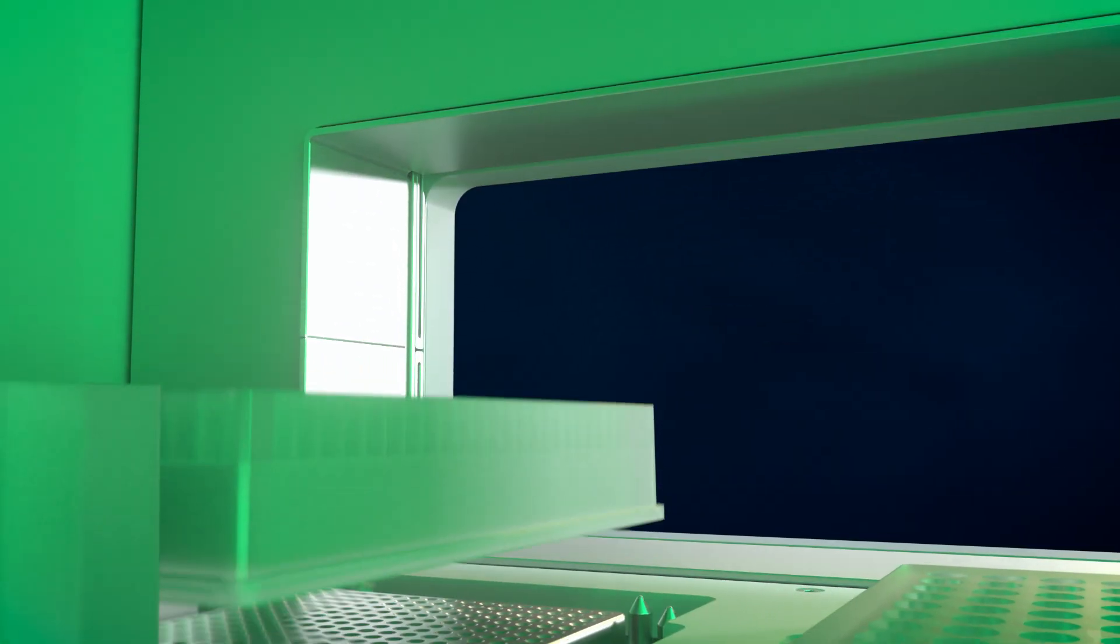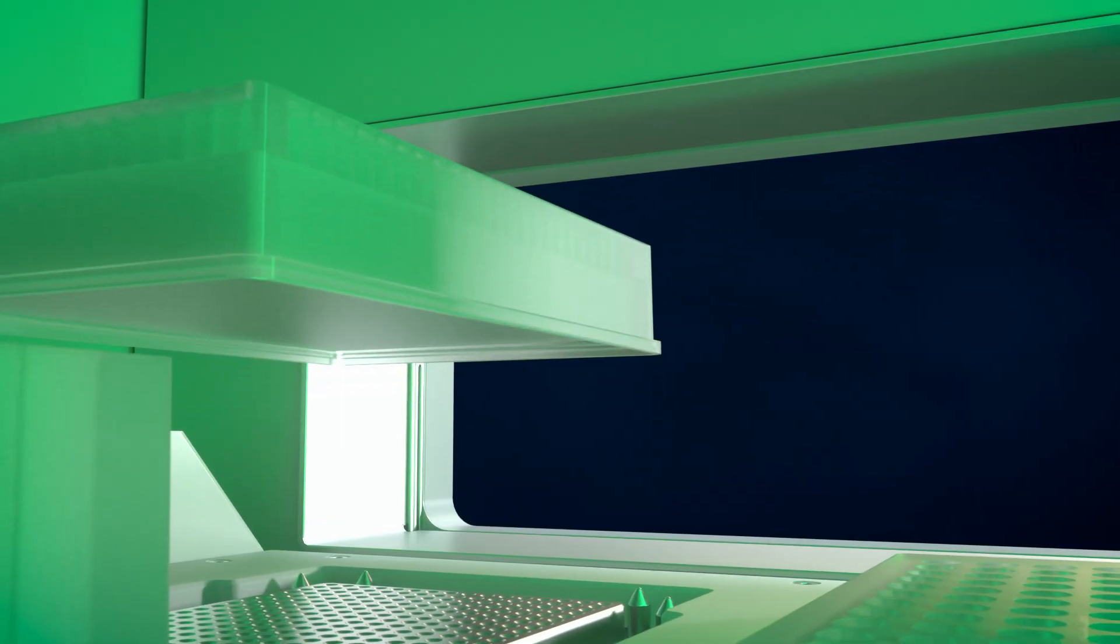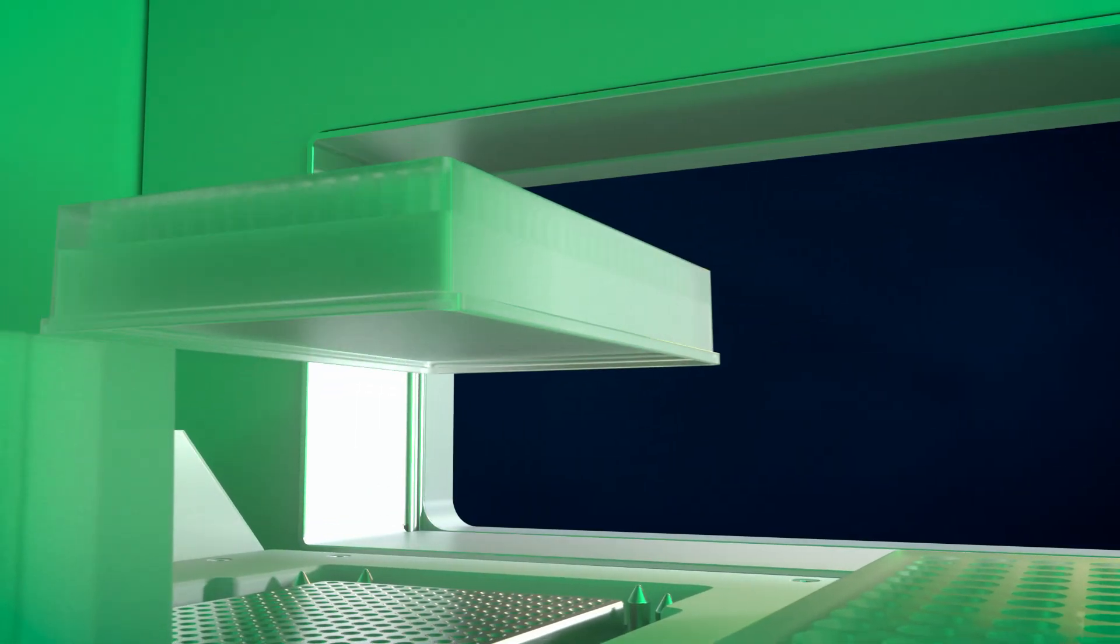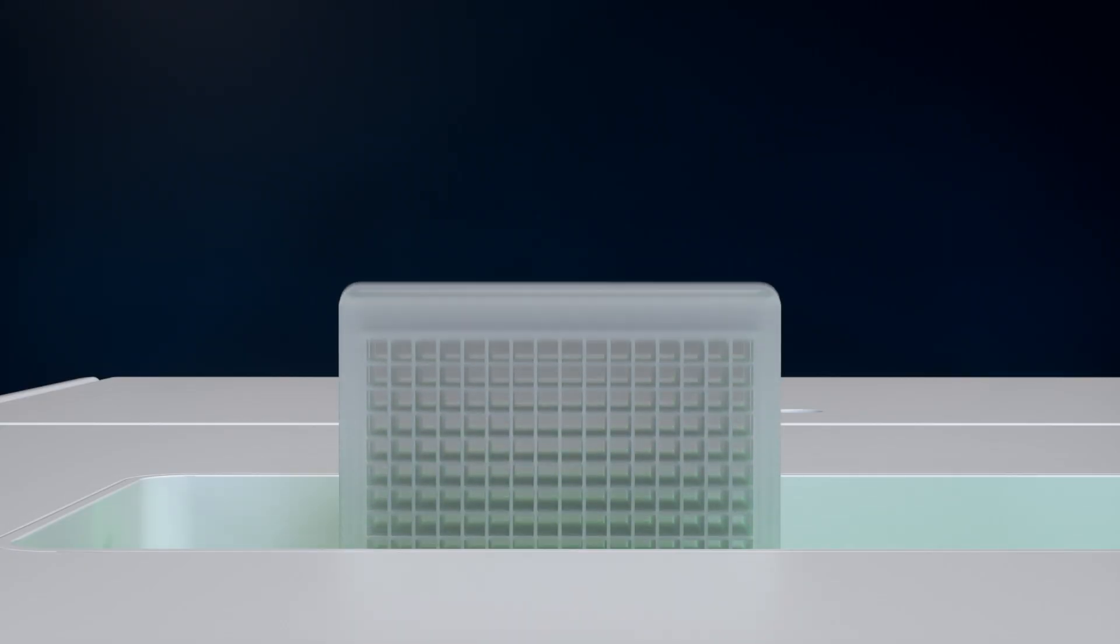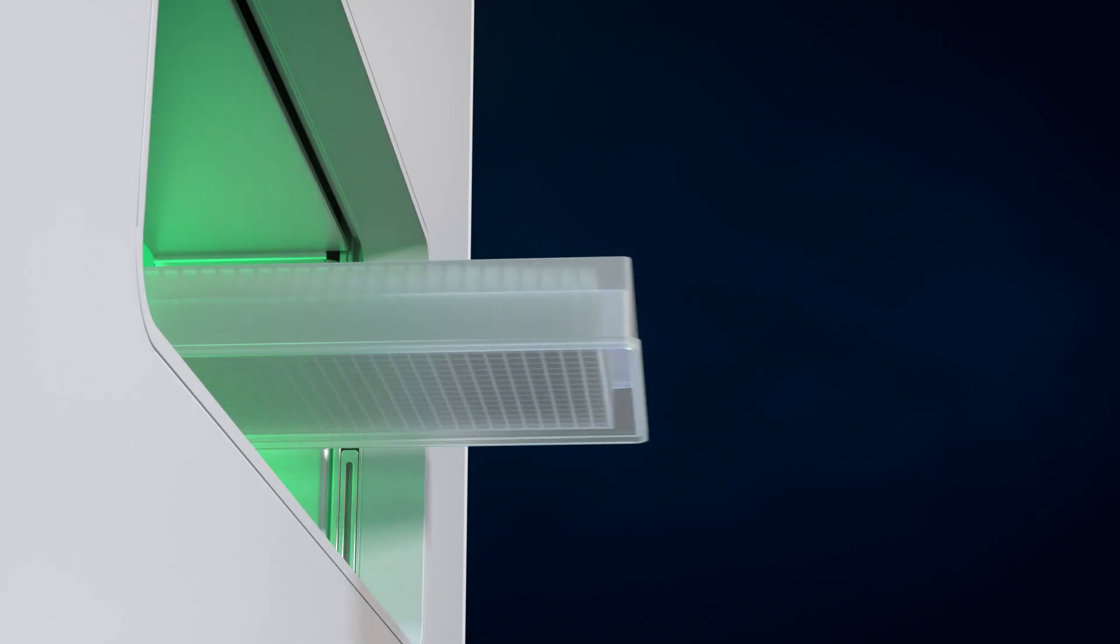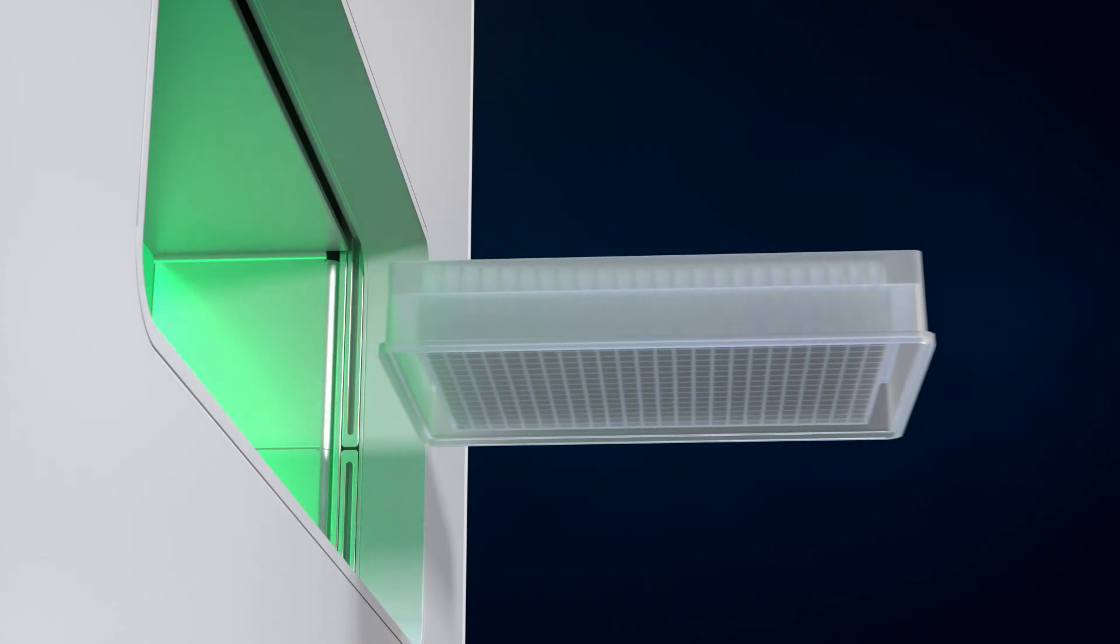As in previous Bruker SPR systems, the Bruker SPR-64 can be accessed by an external robot, allowing for even higher throughput.